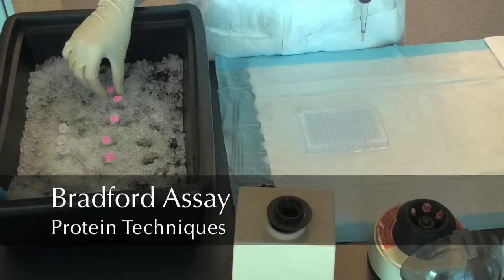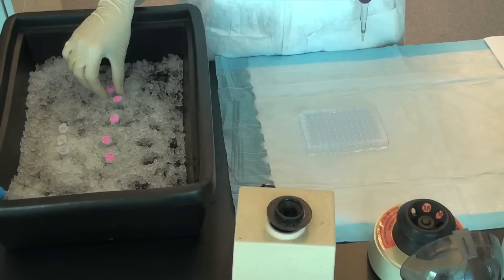Bradford Protein Assay. The Bradford Protein Assay is a colorimetric analytical procedure used to measure the concentration of protein in a solution.